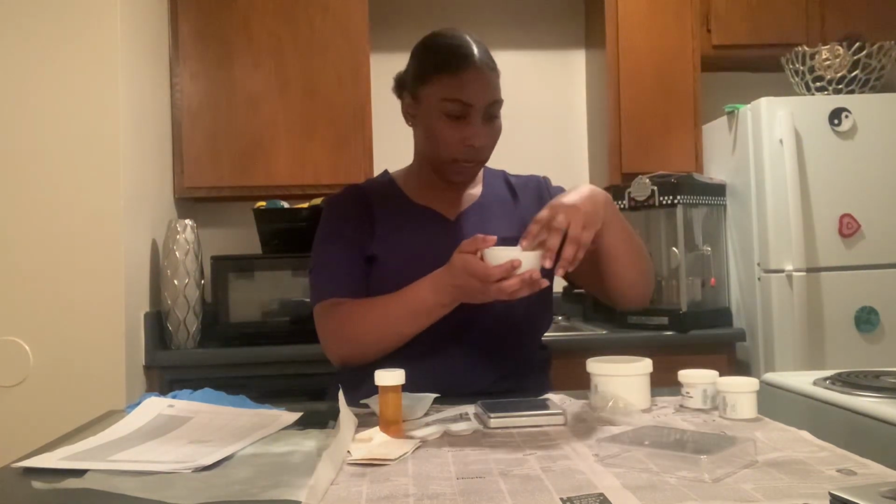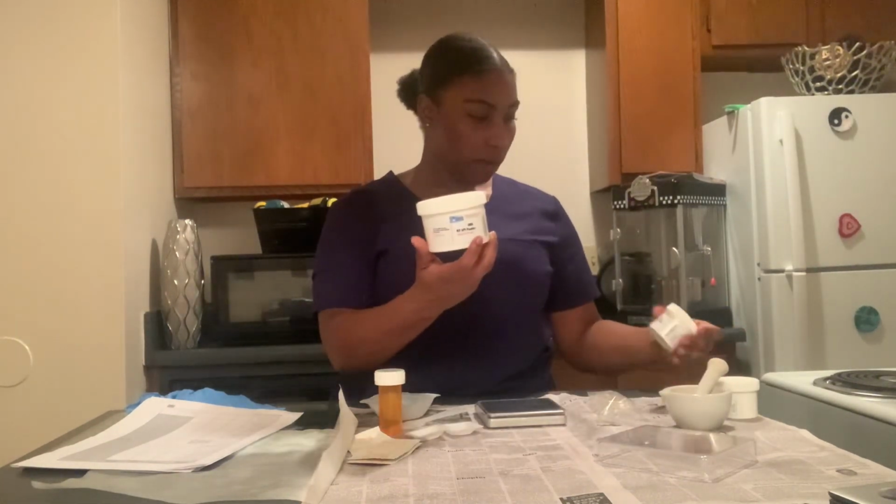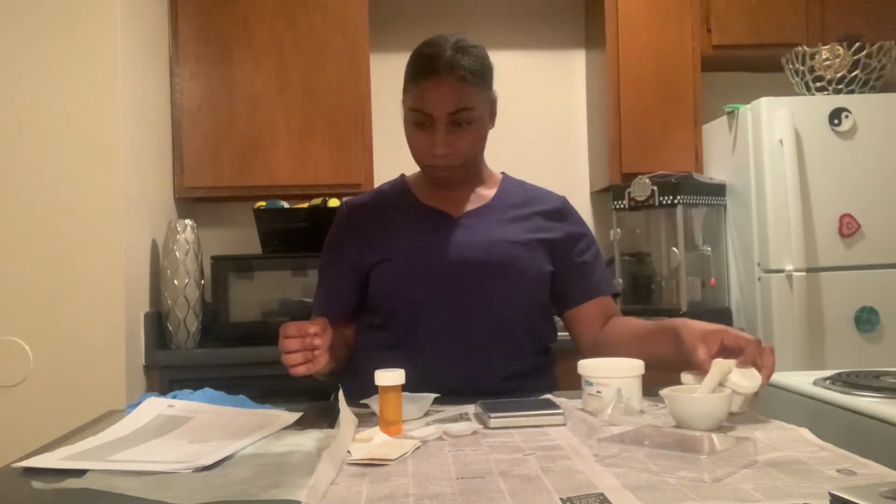Then we have our mortar, and the powder, which is the Symbase that we calculated, and then the caffeine powder, and the ergotamine powder. And then we have our gloves, and a parchment paper to put the powder and stuff on.